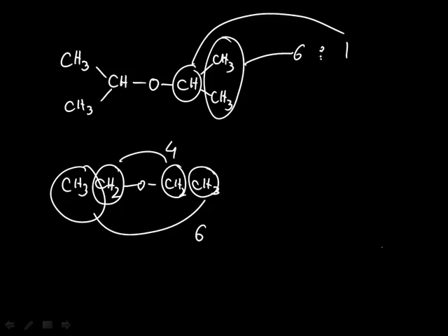And so what we'll see experimentally will probably be 6 to 1 here, compared to 6 to 4, which will actually be noticed as 1.5 to 1 in this spectrum. But the difference at this point will be pretty clear, and we could pretty conclusively determine which one is which based on the integration of the NMR. So this is really where integration comes in very handy.